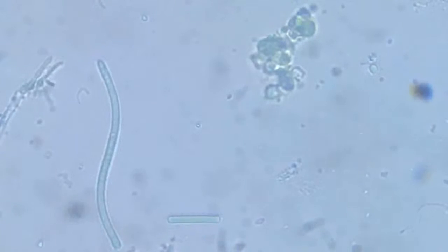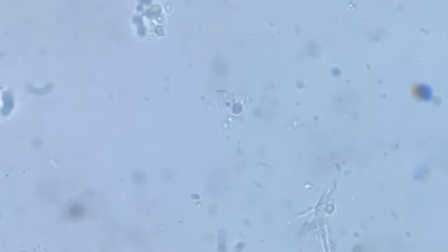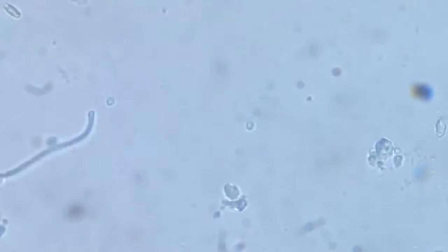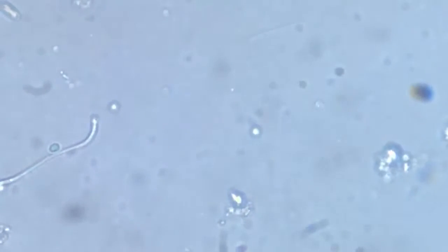Nothing more. Those worms are really tricky to find, though they are very large, but since they are very thin and almost translucent, transparent, it's very difficult.